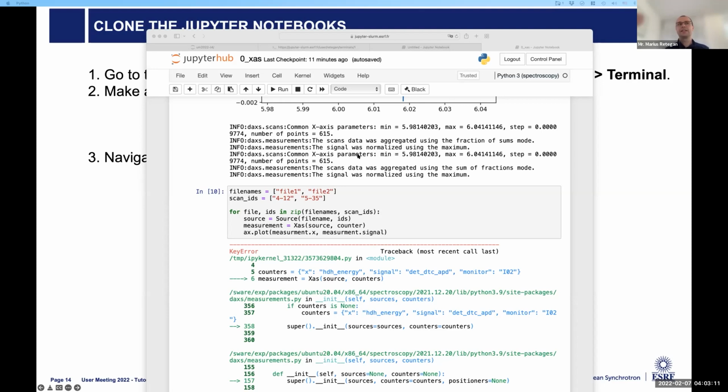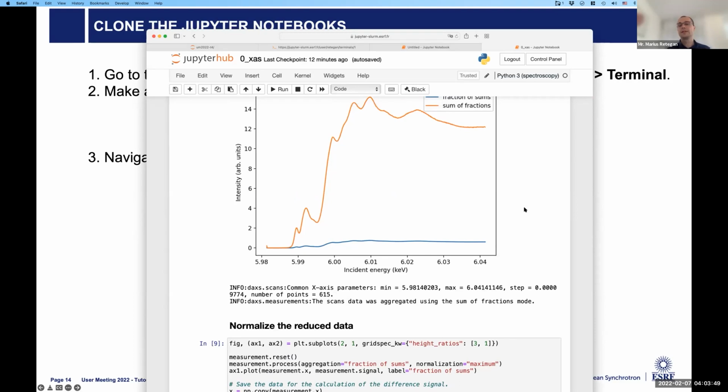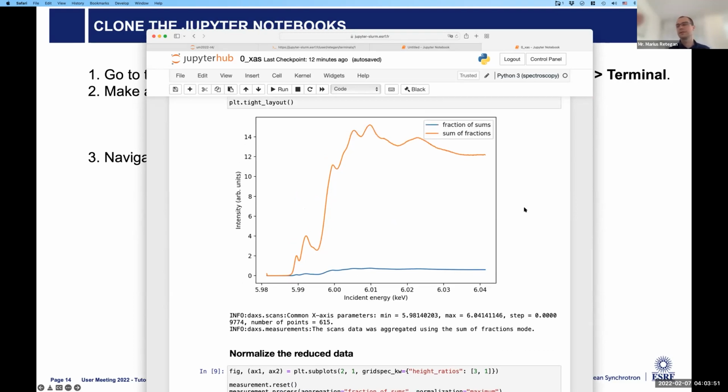Yeah, exactly. So that's one of the issues in trying to analyze data from multiple places, because nobody can agree on what the format is for everybody. At ESRF we're using HDF5, of course we used SPEC before, and at some places they use something else. That's the most difficult part, because if you had something that resembles a common format, then all this data analysis can be repeated with data from any type of beamline and facility.